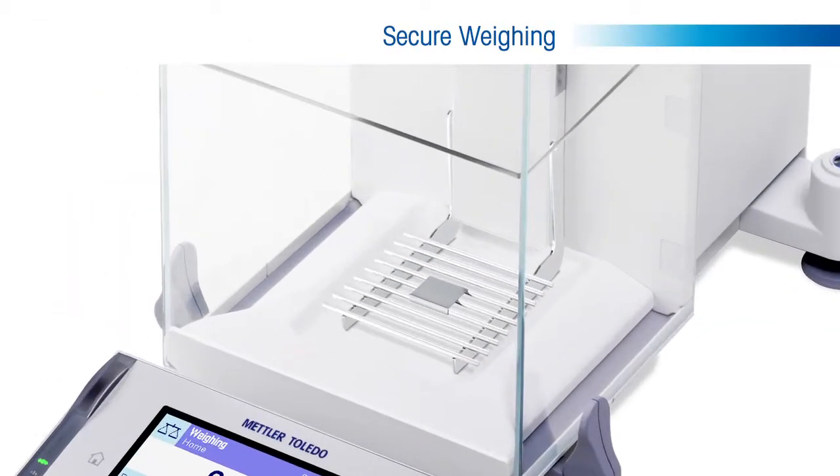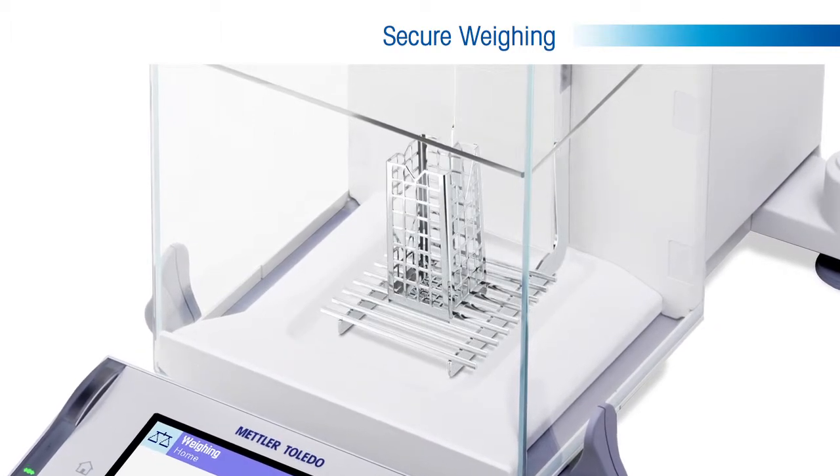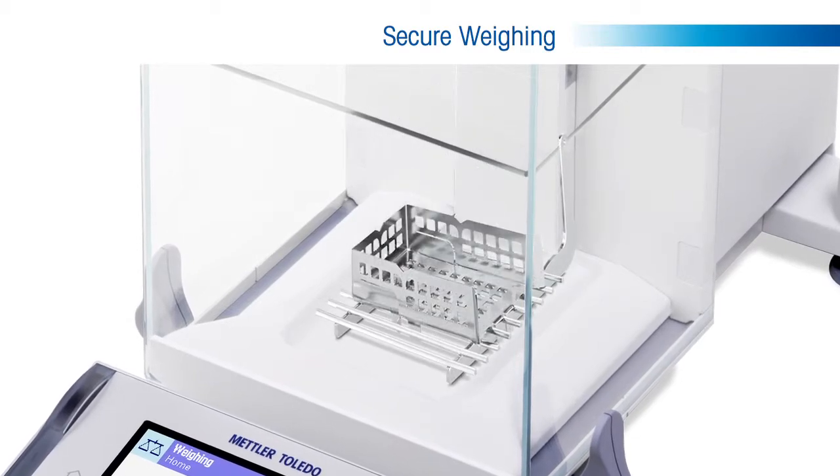Nearly all samples must be weighed with some type of tare container, and it is often a challenge to find the proper one for your sample that also works cohesively with the balance.